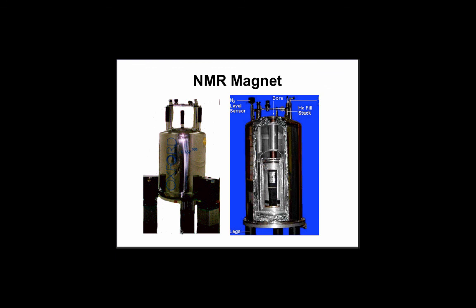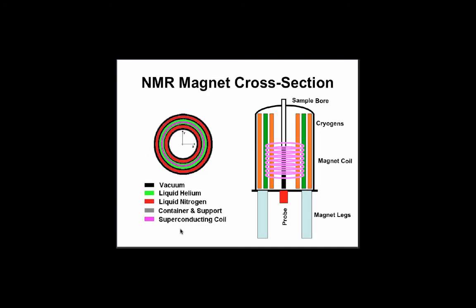Magnets are huge. As I said, they're superconducting. They're sheathed in liquid helium, which then is bathed in liquid nitrogen. They have space blankets wrapped around them, several layers. The magnets are made out of niobium tin. They're wrapped with wire that stretches for miles. They cost about $1 million. So they're not trivial things, and they're basically large thermoses with a relatively small magnet inside.